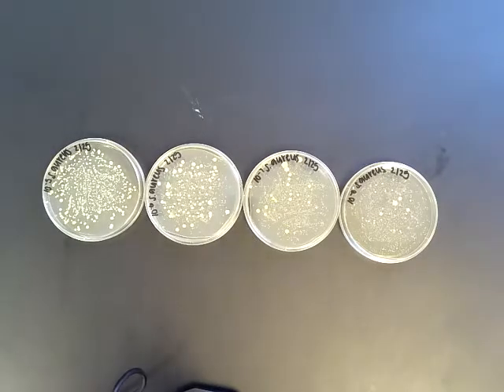In this video, I'm going to talk a little bit about the viable cell count. So viable means that it's alive. And what we're doing in a viable cell count is we're trying to count the number of living cells in a culture. So to count the number of living cells, we serial dilute them, and then we plate the serial dilutions and count how many cells grew. And the way that we count how many cells grew is by counting how many colonies we see.